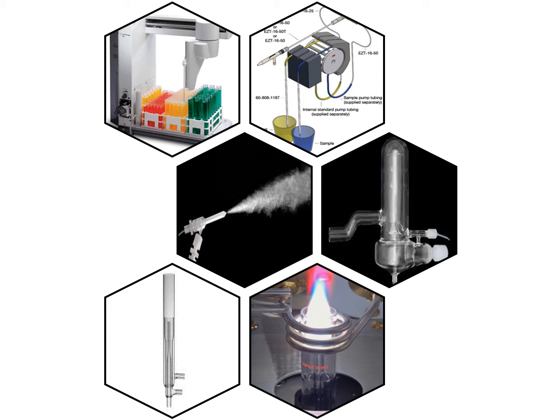So when you actually introduce your sample aerosol into the plasma, it's not got lots of water in it. Okay? And the reason for that is that the plasma basically has to be quite a pure gas to start off with. So this is the device which the plasma is contained within. This is basically a series of glass tubes.